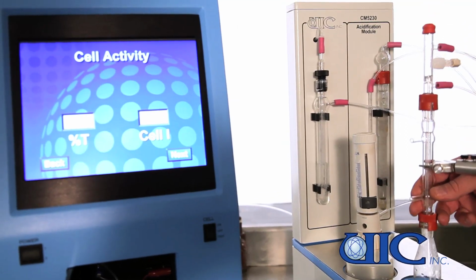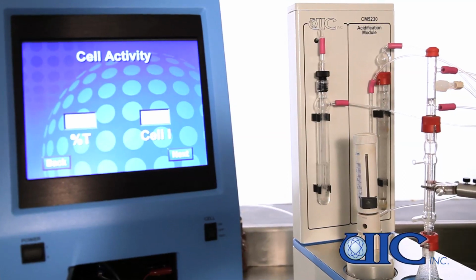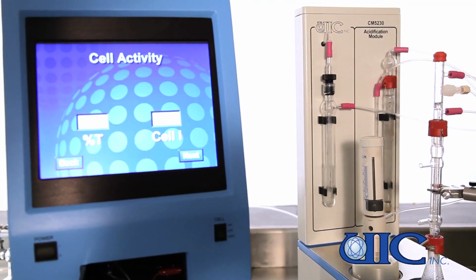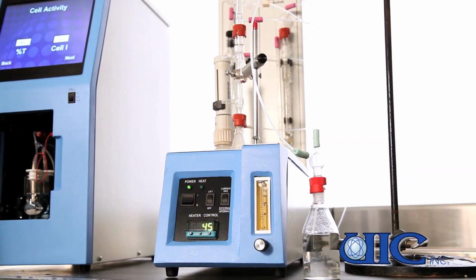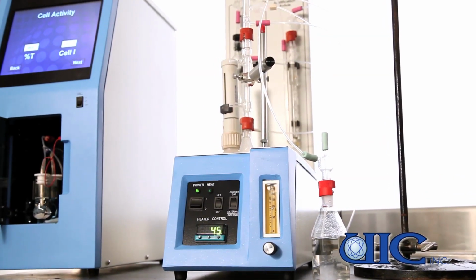Right now we have the heater set at about 45 degrees C, which is a good temperature to run at. It means we don't have to use the condenser to remove any vapor. There are only two interferents for the coulometric detector. That would be sulfur dioxide and hydrogen sulfide.